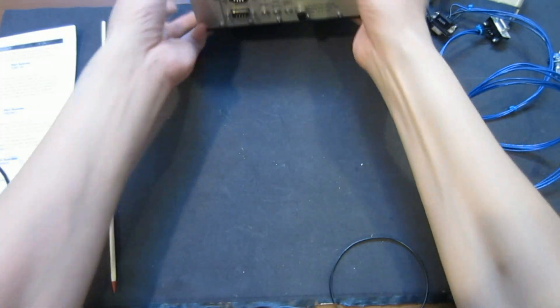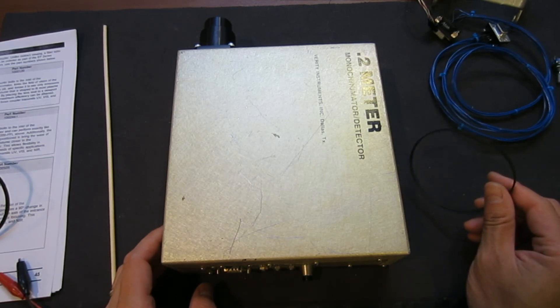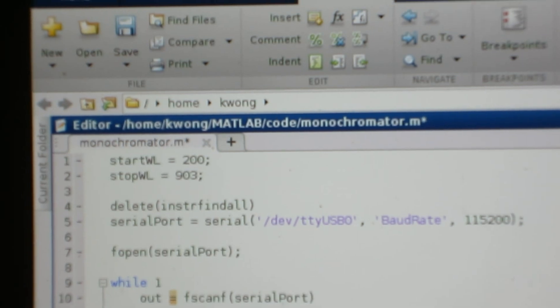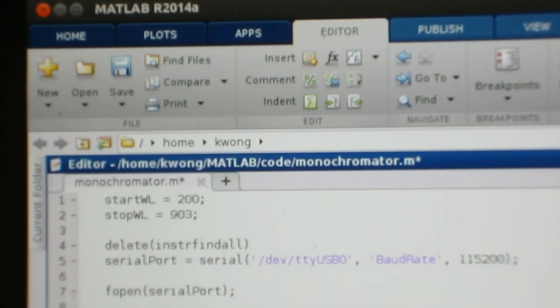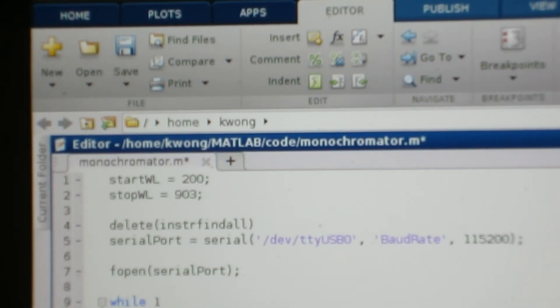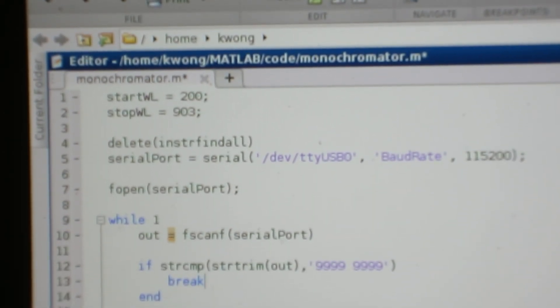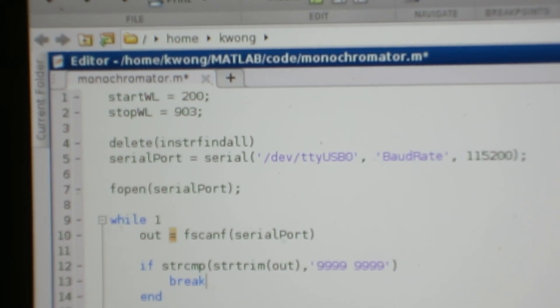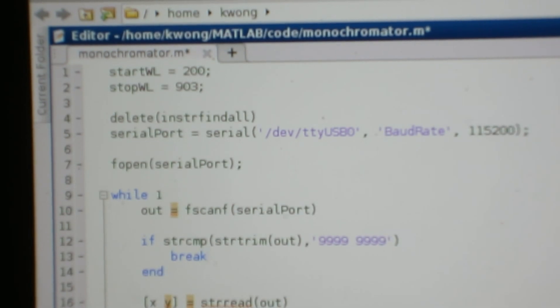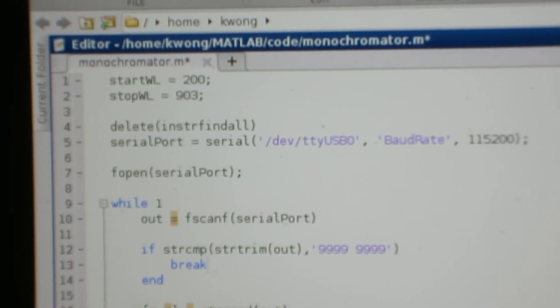Before I show you the experiment, I wanted to show you the code I wrote for this monochromator. The code is written in MATLAB 2014. I came from an academia background and we use MATLAB quite a bit. MATLAB is very nice for doing simple mathematical calculations and interfacing with instruments. But if you don't have MATLAB, the idea is the same — I'll show you what the code is doing so you can use whatever program you feel is suitable.